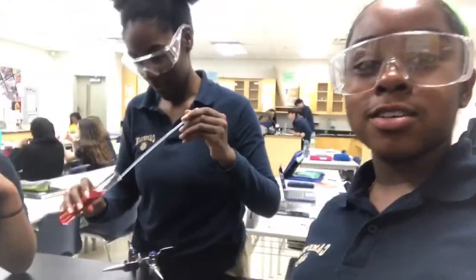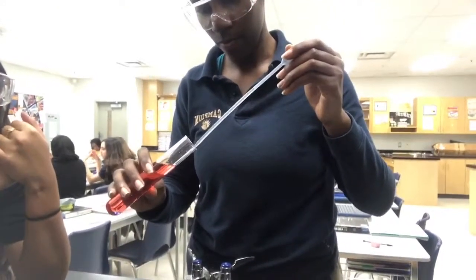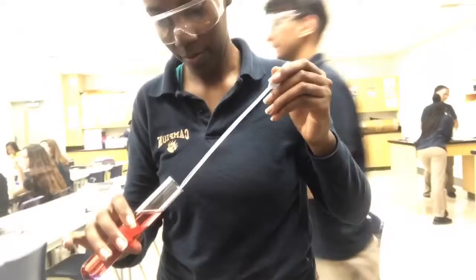Anyways, so we got Sierra right here. She's trying to put the sodium what solution in it? Sodium carbonate solution into the HCl. And we can actually start to see the beginning of a rainbow happening down here, the purple. She's doing a real good job. Do your thing, Sierra. And the rest of us are just kind of waiting on our turn.